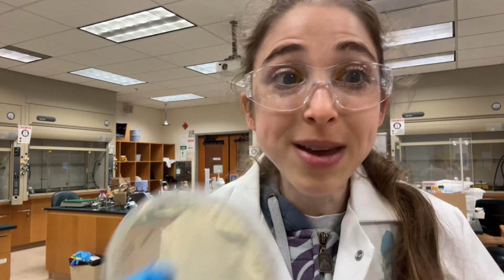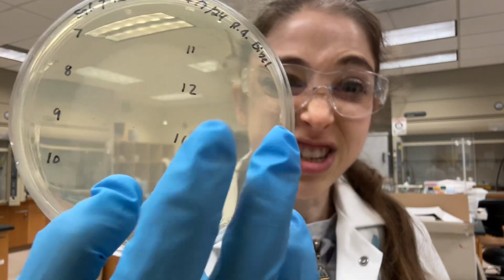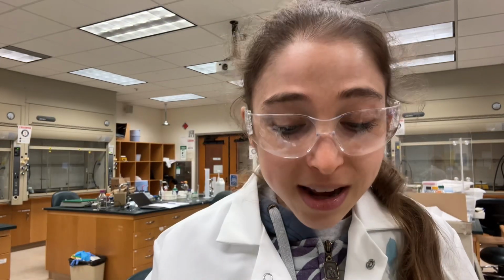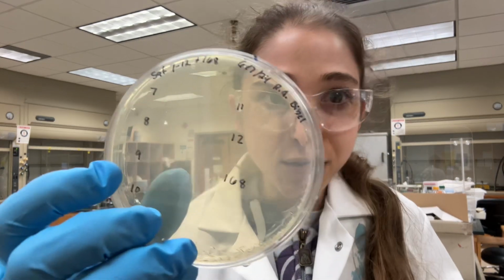And so we're going to be able to use the same strategy that they used in order to knock out malate dehydrogenase from this strain. So you can see subtilis here wasn't growing. But then when you knock out malate dehydrogenase and stick in its place kanamycin, you're able to get that growth. And so we want to do the same thing with Bacillus subtilis. And so it's really, really exciting that nothing grew on this plate, because that's telling us that these bacteria are not naturally resistant to kanamycin.